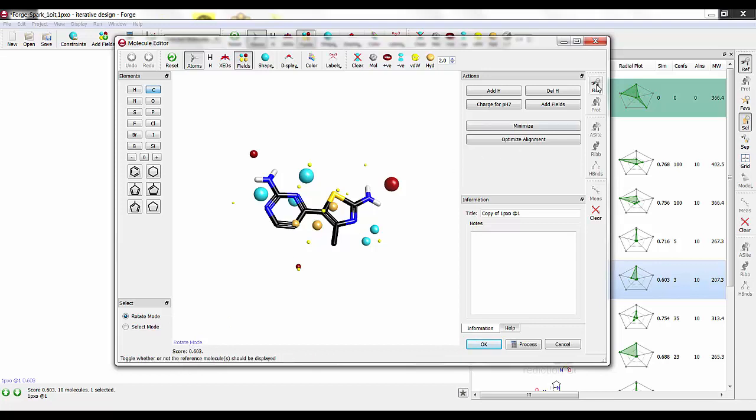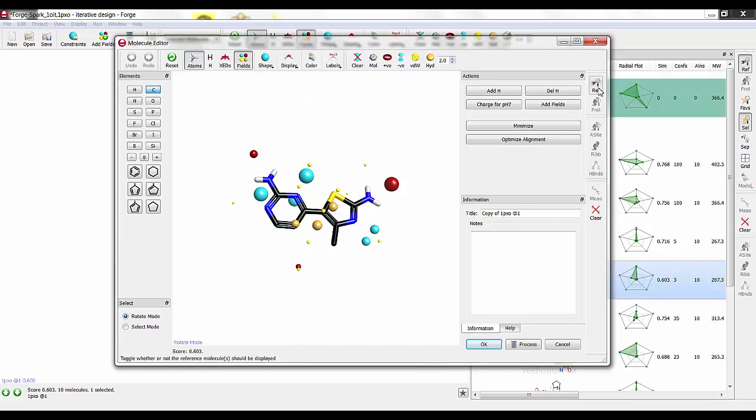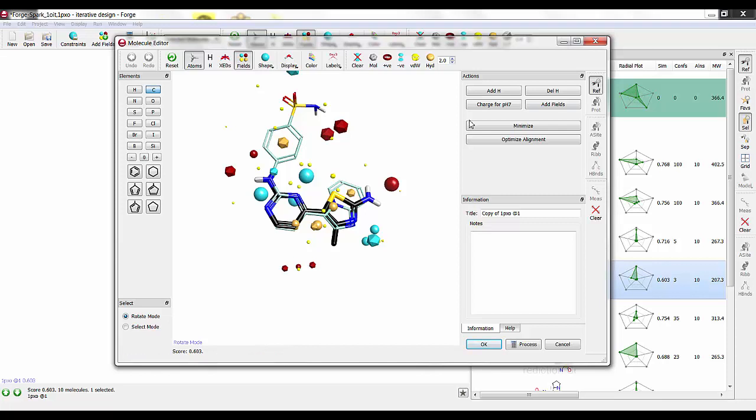We're showing the alignment score to the reference in the lower left-hand corner. If we click this reference button over on the right-hand button bar, we can turn our reference structure on and off so we can guide our design efforts. What I'm going to do is build the exact same fragment—this phenyl sulfonamide moiety—onto this amine and see what happens to our alignment score.